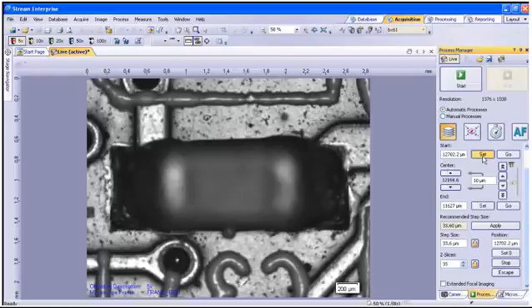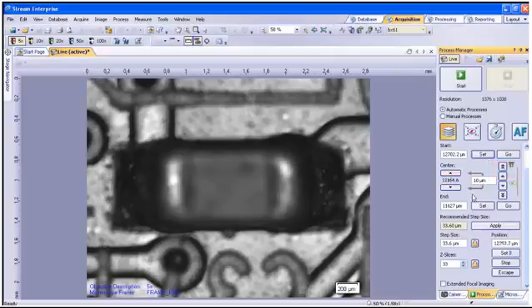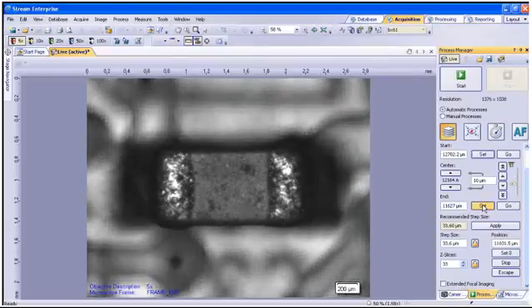Since the image is at bottom of focus, you will want to select Start Set Point. Always start at the bottom level of focus so the image does not become inverted in 3D view. You will now need to drive focus to the top level of the focus range, or the highest point of your sample. This can be done using the up arrow buttons within the Process Manager, or by using the hardware control focus knob on the microscope frame. Once this point has been reached, you must set the end point.